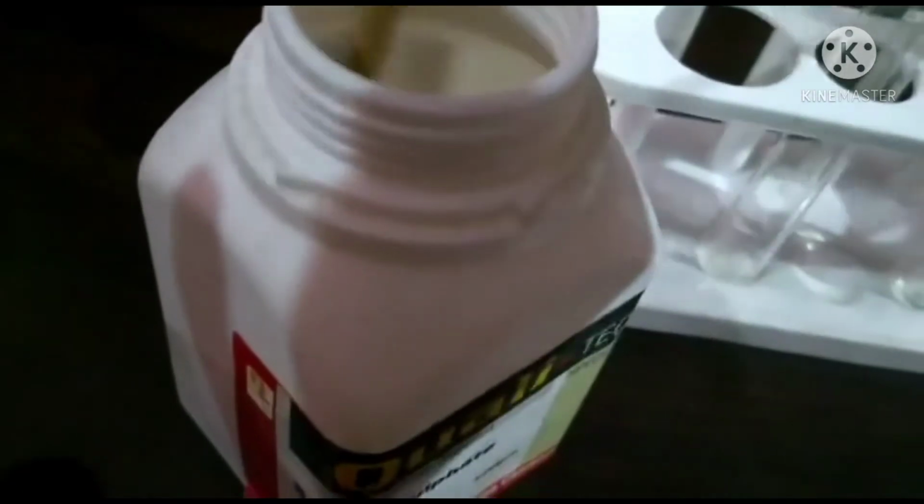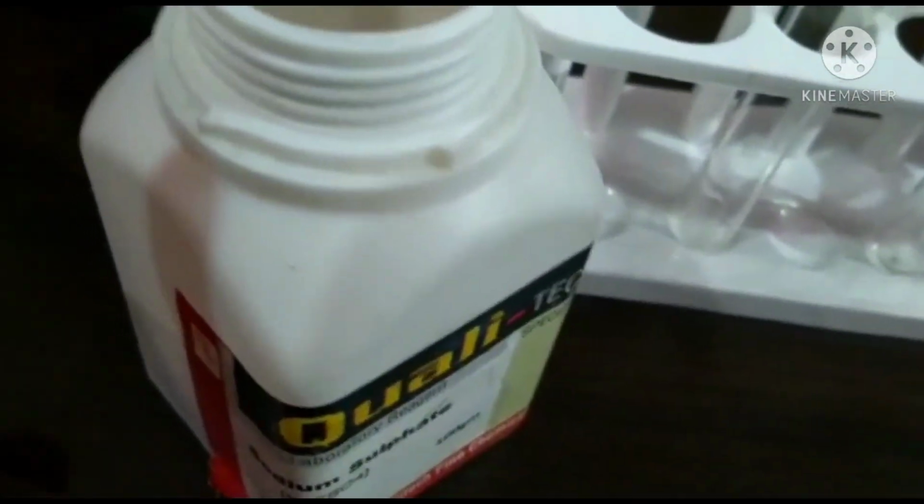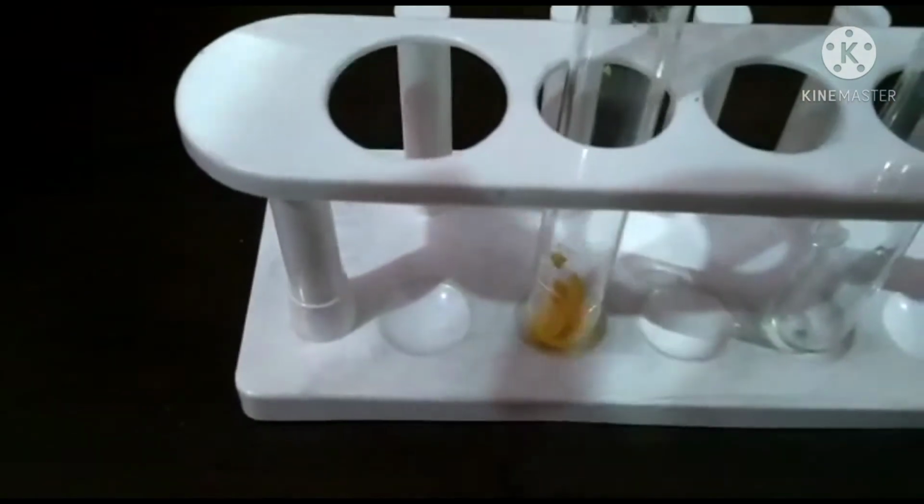First we will take sodium sulfate in one of the test tubes. Add water to the sodium sulfate.